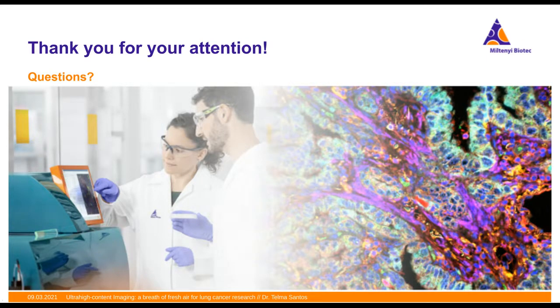Okay, great. Thank you so much for that answer. Next question here. How many antibodies are used per cycle, and what chemistry is used for signal removal? So currently we can use up to 3 antibodies in one cycle, plus the DAPI signal.